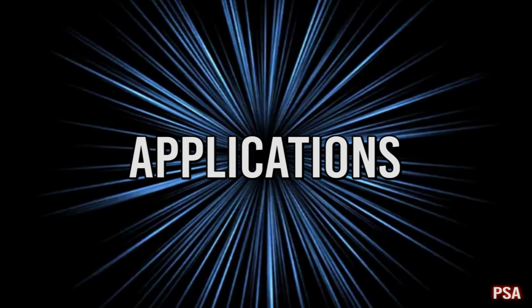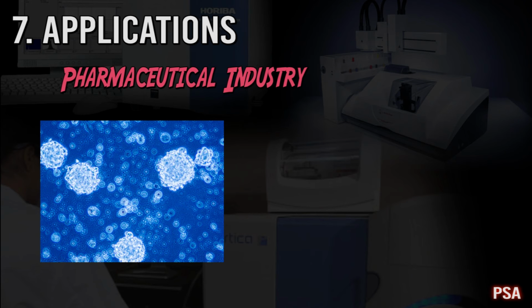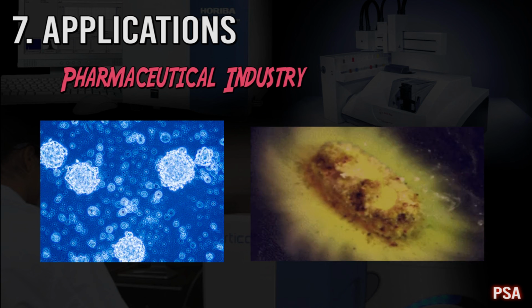For its application, pharmaceutical industry. The tinier the particle is, the larger the occupied specific surface area, which tends to make the particles dissolve more quickly. In other words, the drug with a smaller volume will be metabolized in a quicker manner.